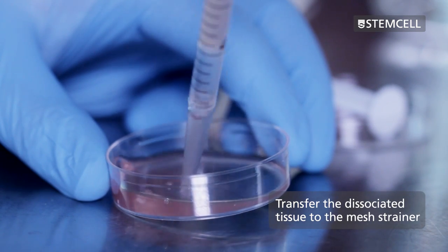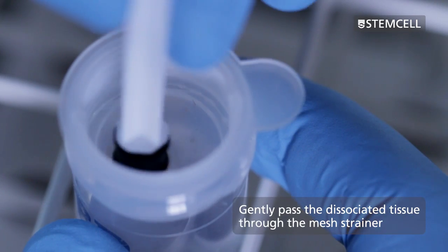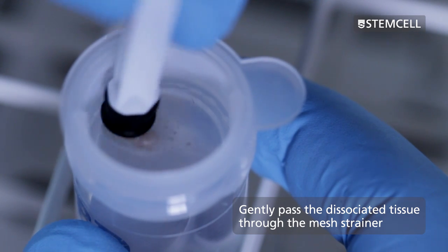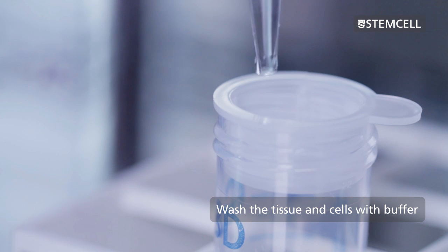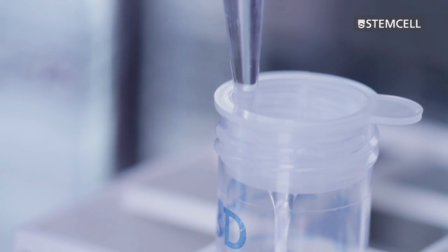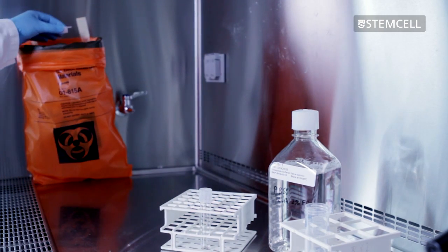Transfer the dissociated tissue and the dissociation media to the mesh strainer. Gently pass the dissociated tissue through the strainer. Wash the tissue and cells in the strainer by gently adding a few milliliters of PBS. Repeat this step and then discard the leftover tissue and strainer.